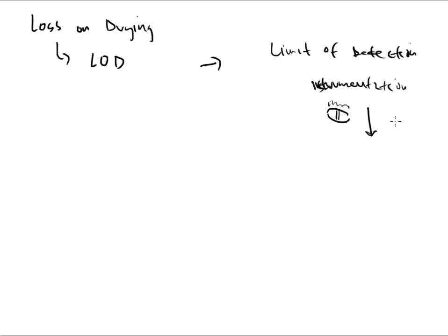So, two different abbreviations out there in the world, both unfortunately are LODs, and you just have to have some context behind what LOD actually stands for. Are you talking about loss on drying method, or are you talking about the limit of detection test? You have to be really clear cut, but here's the story, folks.